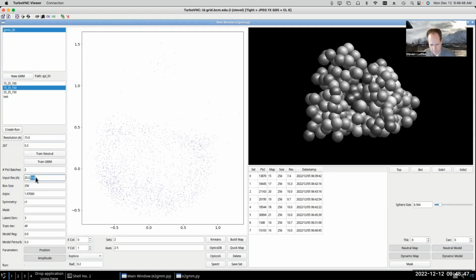The upper number that you see here is a high-pass filter number. Again, that's in angstroms. And that just allows you to eliminate things like ice gradients from getting considered in the network. I can't give you one absolute number. Usually this is going to be somewhere between, say, 100 and 200 angstroms. In some data sets, if the ice is nice and flat and everything like that, you can actually just leave this out entirely, and it won't do any high-pass filter, and it'll all be fine. I would normally recommend putting in something like around 150.